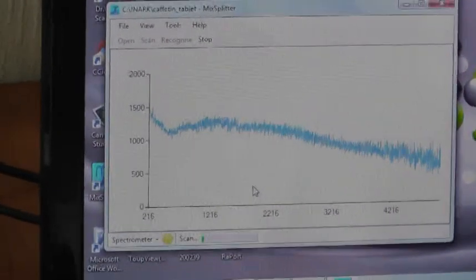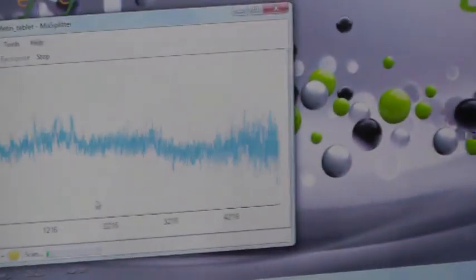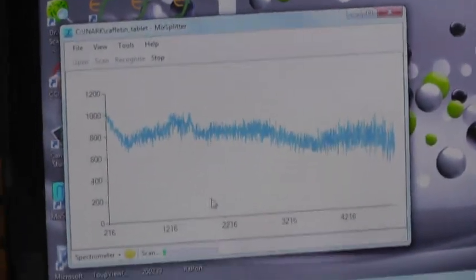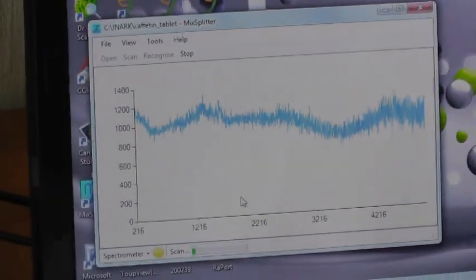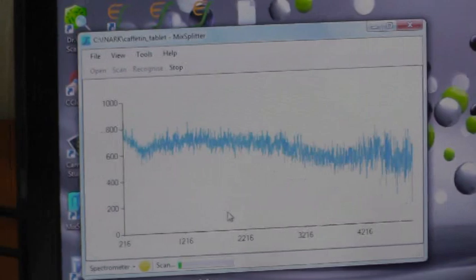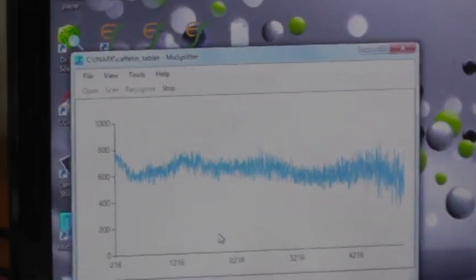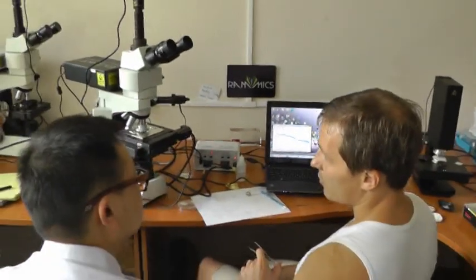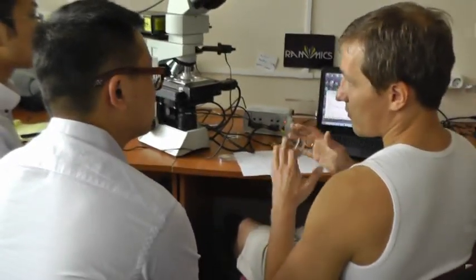And after we have some separate groups of identical spectra, we recognize every group using the database. So before we recognize spectra, we combine them in several, like 10 groups containing just similar spectra, and then we use the standard recognition system on the whole database.